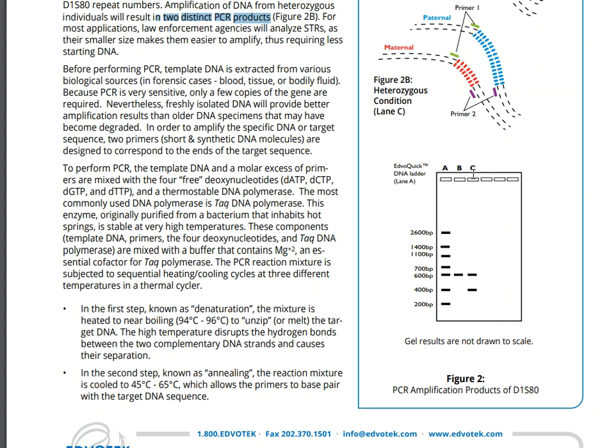In lane C, this is from maybe a child whose father and mother are a little bit different. When we begin to look at these, it cleaves in the right way, at the right base pair set, but one half of the parent is looking a little bit different. One's a little bit larger, one's a little bit shorter, and that's what you saw in the example above.